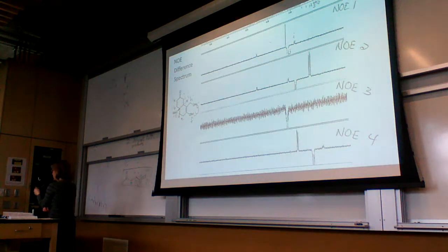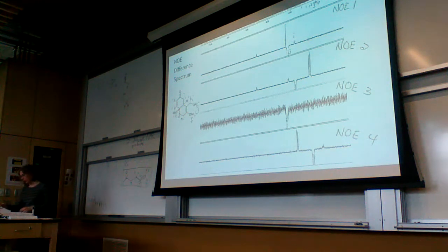Okay. Let's do a brief introduction to 2D NMR. And then we'll come back and go over more of it on Wednesday.